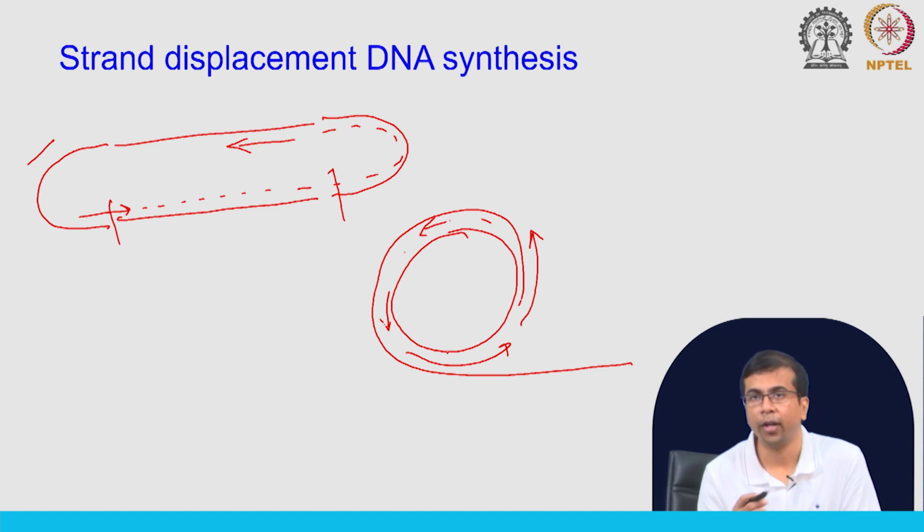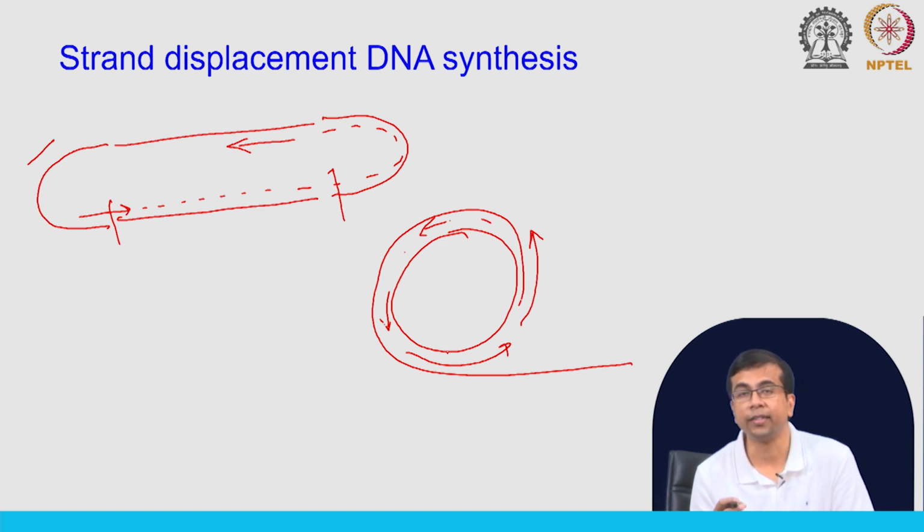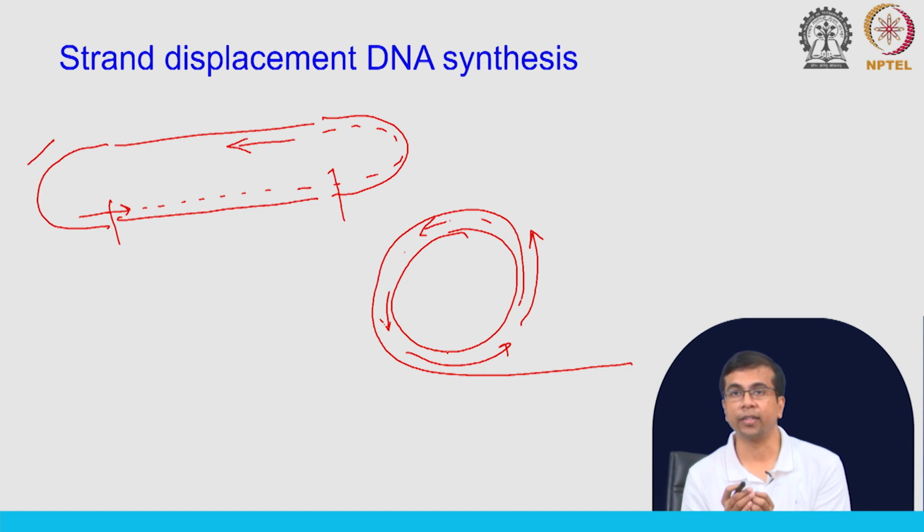Why would you do that? We will talk about that in a moment, why we want to sequence the same molecule multiple times. But there is this capability where you can do this strand displacement DNA synthesis, so that you go over the same sequence multiple times.